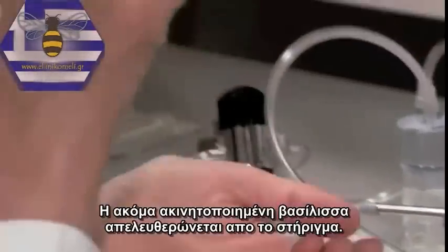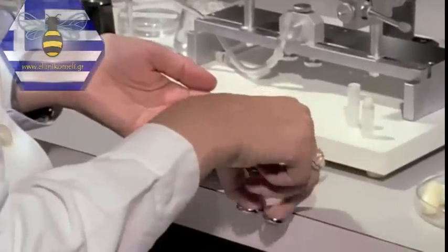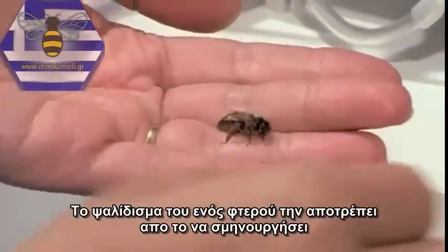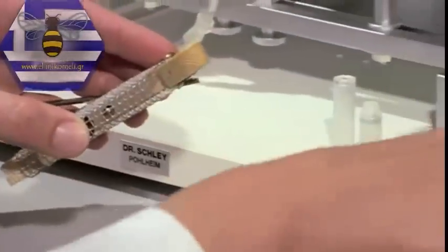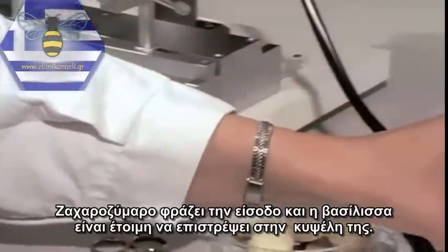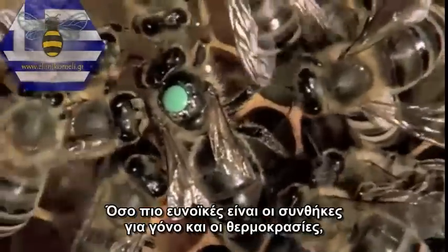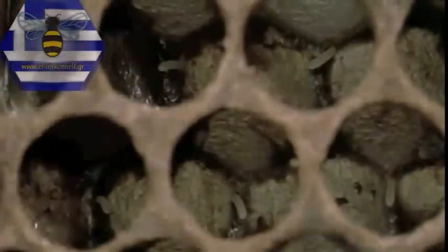This concludes the insemination procedure. The syringe and the hooks are removed. The still narcotised queen is released from the holder. Clipping one wing prevents her swarming later on, but it is nonetheless essential to cover the entrance of the mating cage with an excluder as well. Bee candy seals the cage and the queen is returned to her hive. The more favourable the brooding and temperature conditions are for the queen, the sooner she will begin to lay eggs.